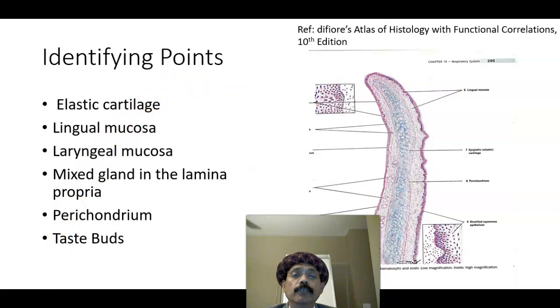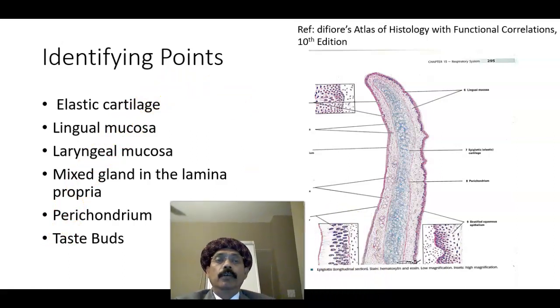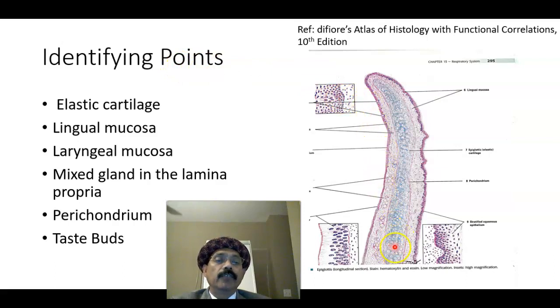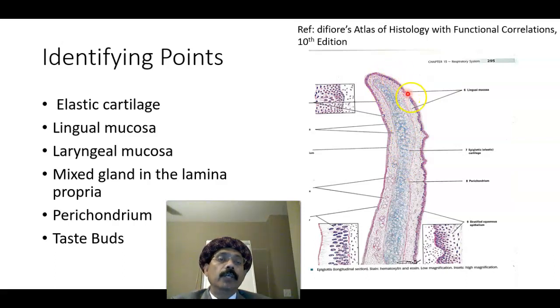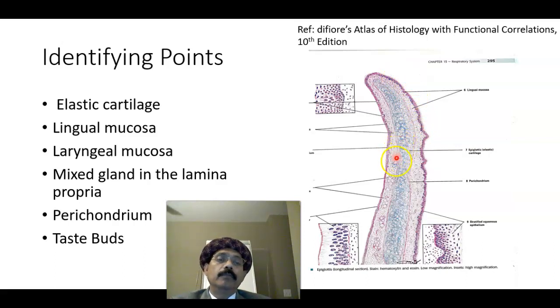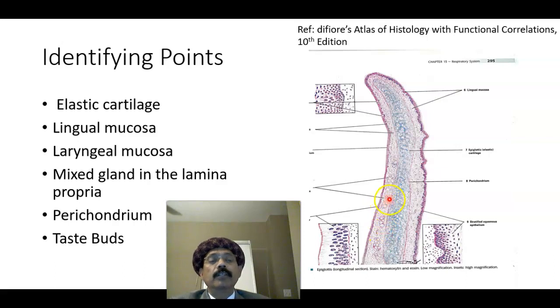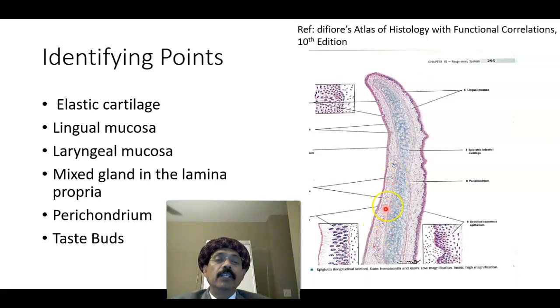If we go to the histology of the slide of the epiglottis, we will find out that the central core is formed by the elastic cartilage. On both sides we have the epithelium and lamina propria, and we have glands in the lamina propria — mucous gland, serous gland, and also seromucous glands are present here in the lamina propria.